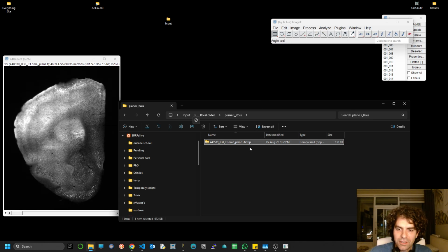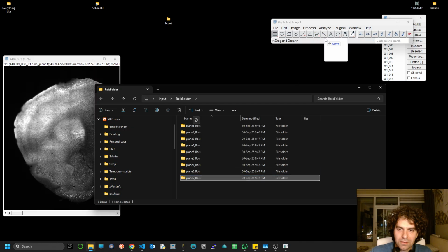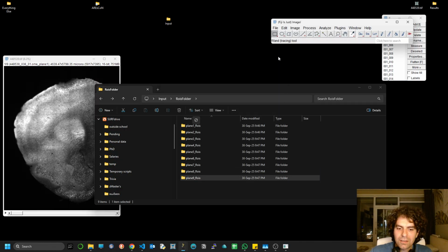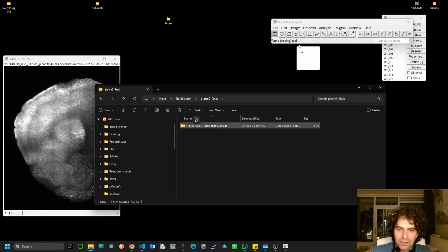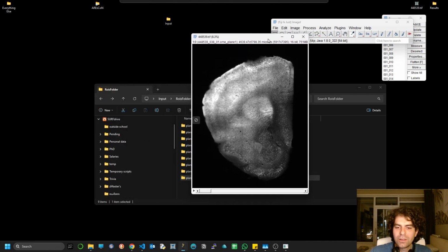So loading the third, the fourth. Oh, it's having trouble again. That's interesting. The fifth. Okay. So now we have a lot of rows.